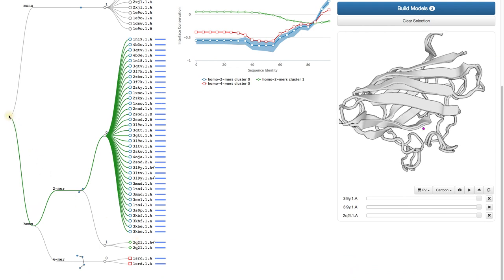The green lines show templates which likely lead to models with the correct quaternary structure. If you place your mouse over it, you see the Quaternary Structure Quality Estimate. The cutoff is at 0.7.